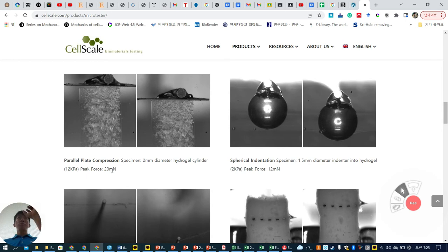지금 여기 옆에서 이렇게 보고 카메라를 보는 거죠? 네, 카메라를 보는 거예요. 계속 그걸로 찍고 있는 거예요. 수치를 크게 보는 거예요. 셀 레벨로 볼 수 없죠. 스페로이드가 맥스인 것 같아요. 플레스도 아니고.